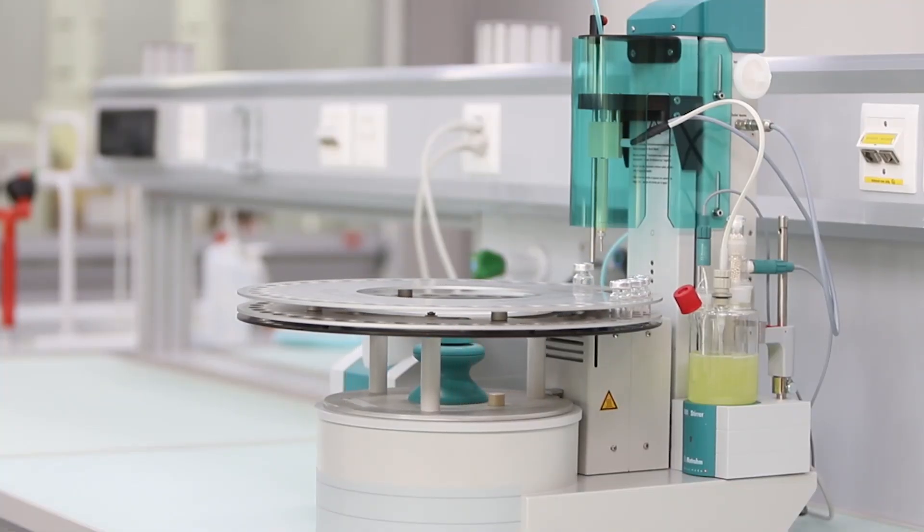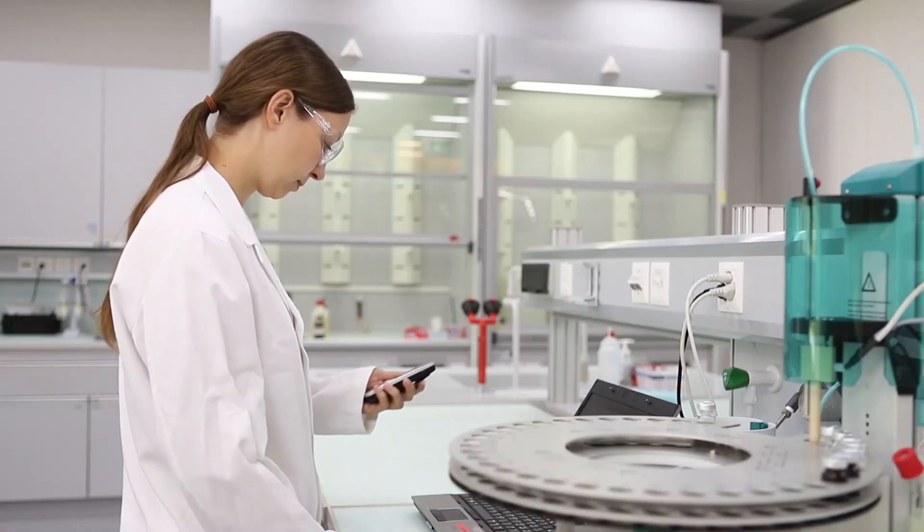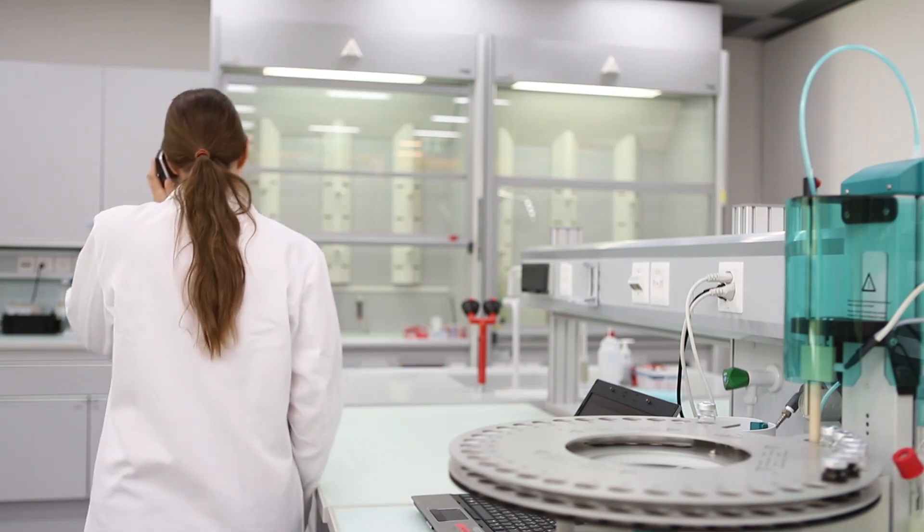If you've opted for an automated system like the 874 oven sample processor from Metrohm, you can dedicate your time to other tasks while your system analyzes the samples fully automatically.